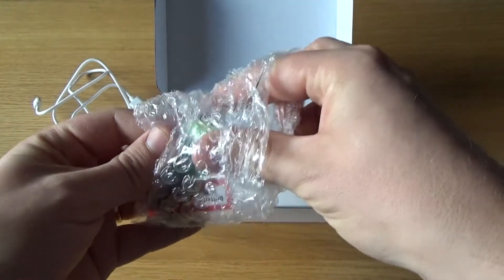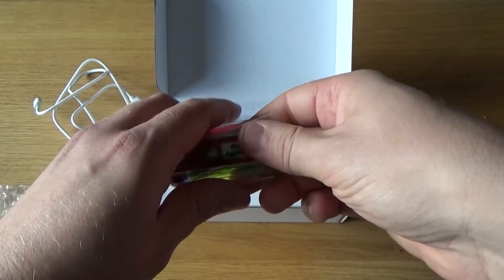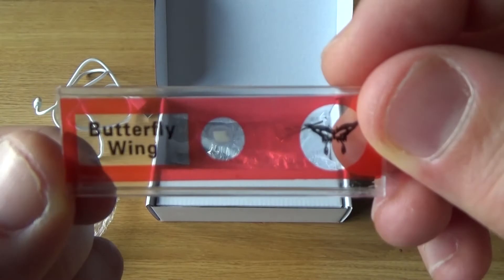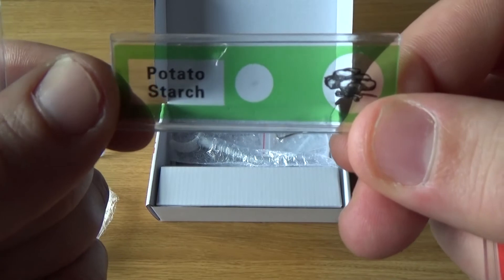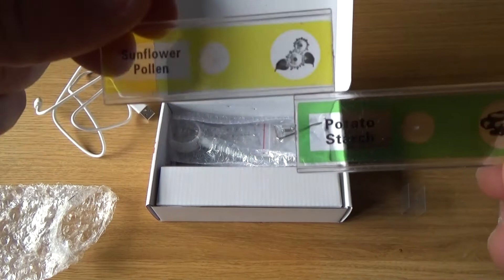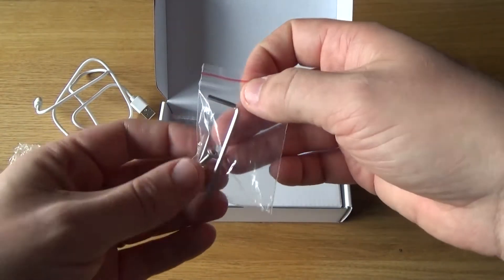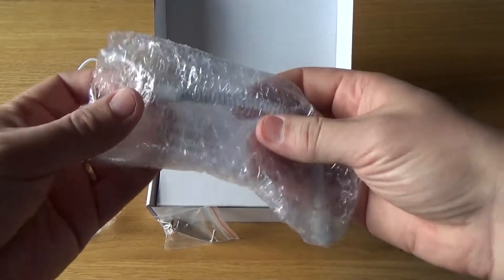These are the so-called slides — you get 12 of them, and they are literally little plastic sheets. They're not made from glass, so they're not perfectly clear, but they do a fairly good job. At least they're safe and won't break. You get samples like a butterfly wing, potato starch, and sunflower pollen — 12 little encapsulated examples. Personally, I didn't find those so great. It's better to go out and find your own items — that was much more engaging, also for the kids.